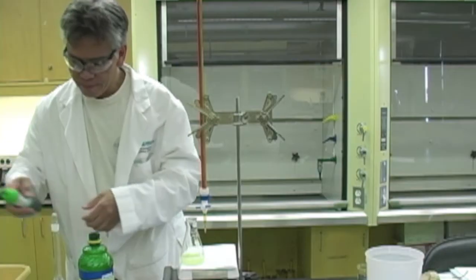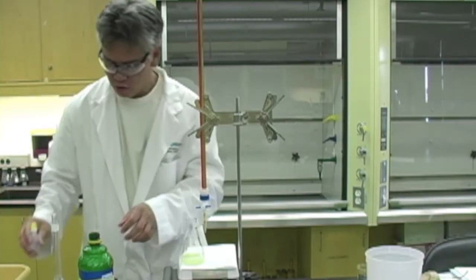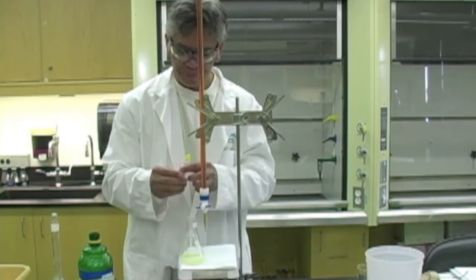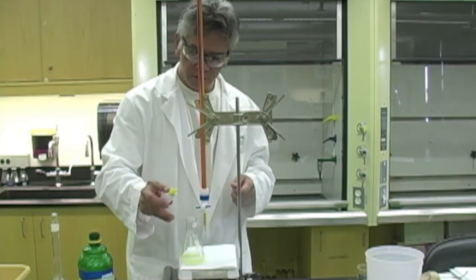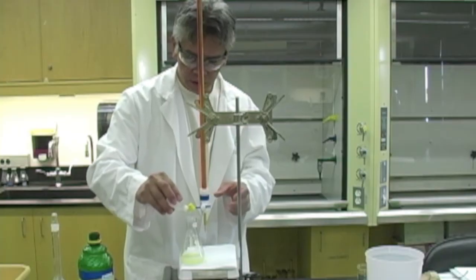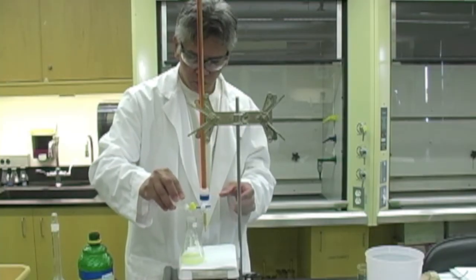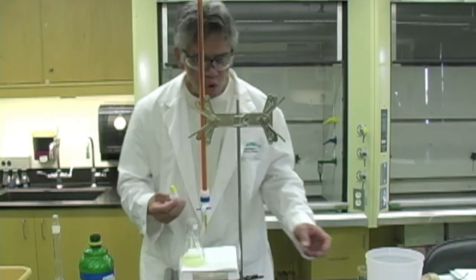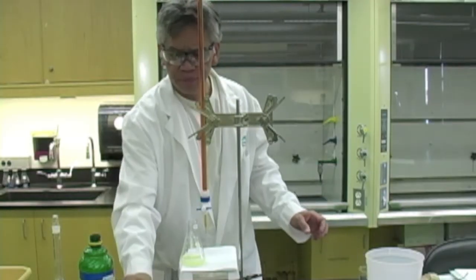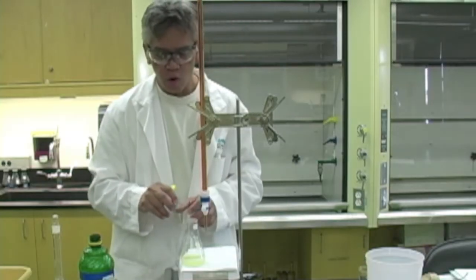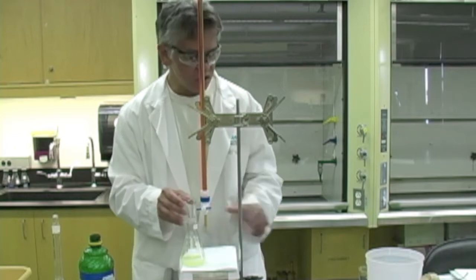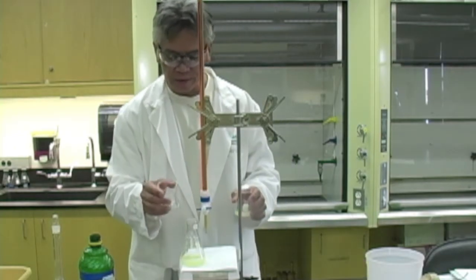The next step is to add your 10 drops of starch indicator. What you might want to try and do before you even start the experiment is test or do a pre-titration so you know exactly what the endpoint looks like.